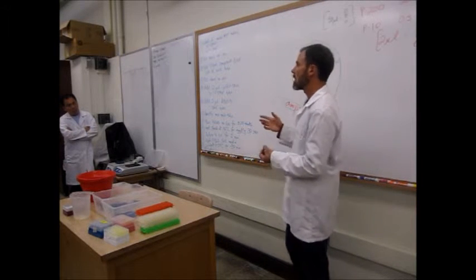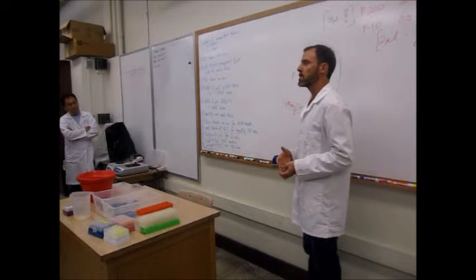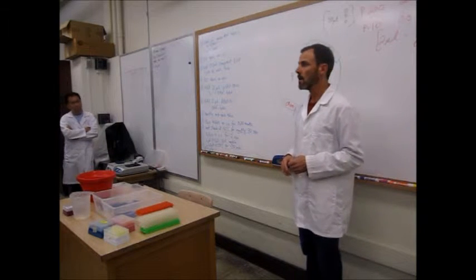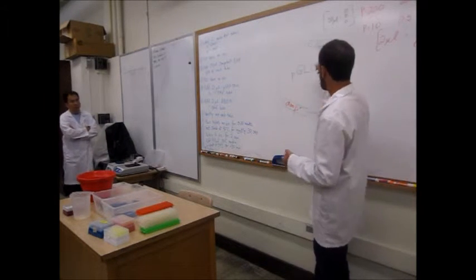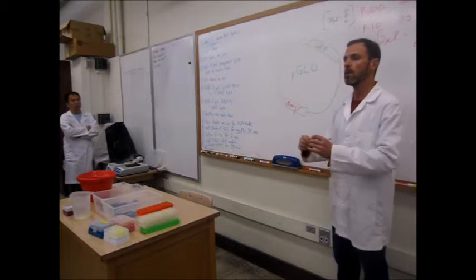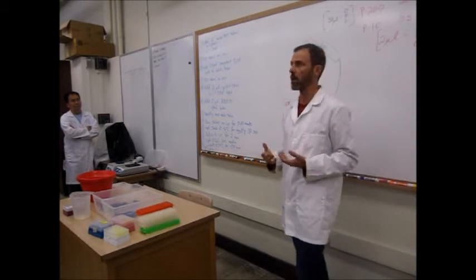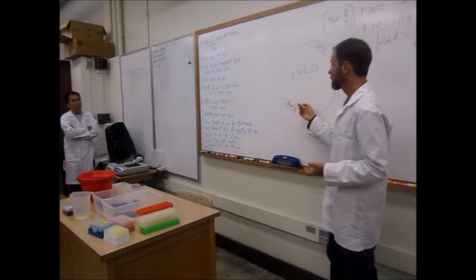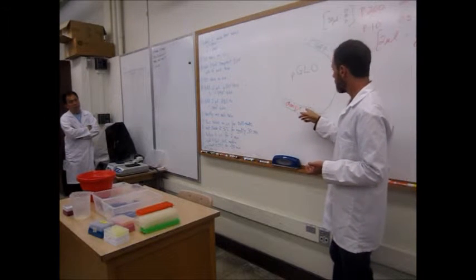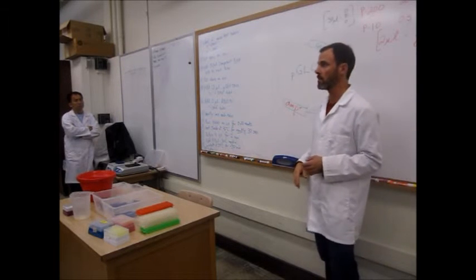And so what we do is we plate the cells on nutrient agar with ampicillin in it, and the ampicillin is going to kill 99.99 something percent of the bacteria. The only ones that survive have pGLO in them, because they're resistant to the ampicillin. And so we get these nice visible colonies that also have GFP in them, and so they're glowing green. We call it a selectable marker, right? So we grow them on ampicillin plates, and we're selecting for those that have ampicillin resistance. They're the only ones that are going to survive and grow.